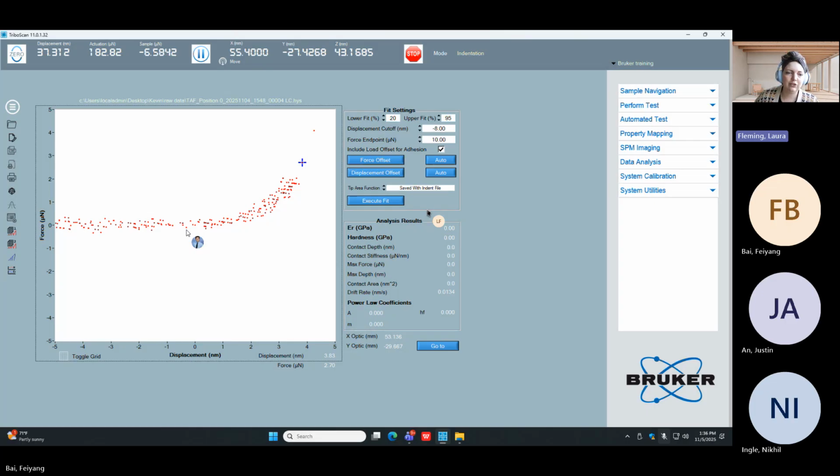Okay, good. Now do you see that we've gone back to 4? And your 0,0 is now much better. It re-zeroed. So you open it, you find your 0 point, you put your reticule there, and you click Control G. That's how you manually re-zero.